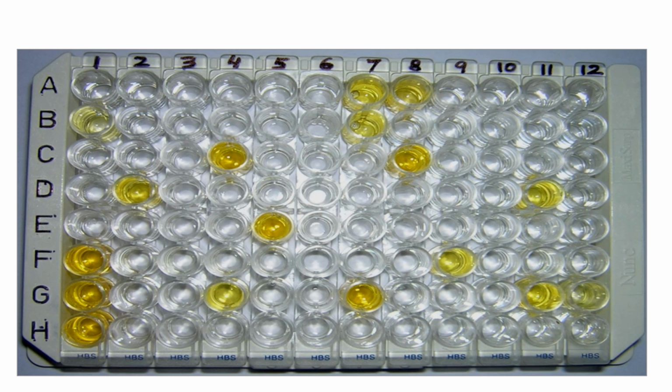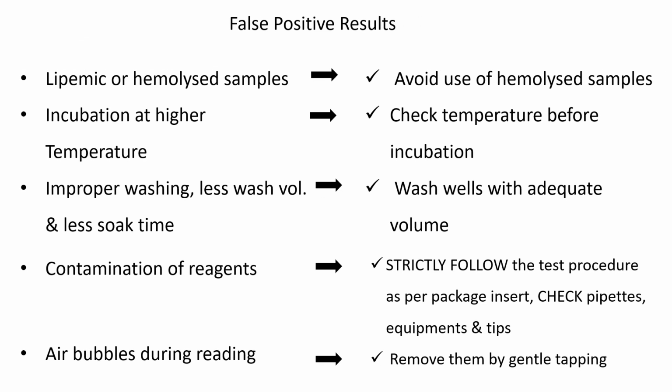Next one, if you see, different wells are getting colored. So this is the false positive result. The reasons are lipemic or hemolyzed samples, so avoid use of hemolyzed samples.